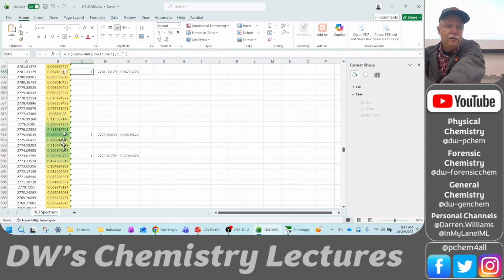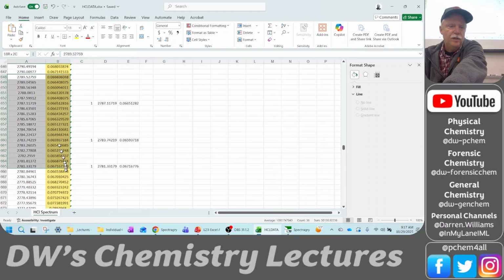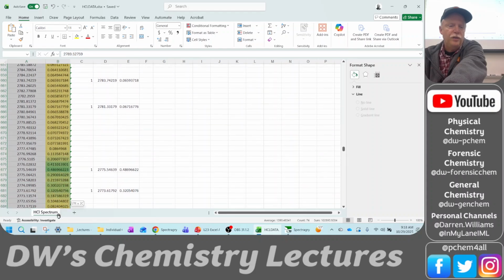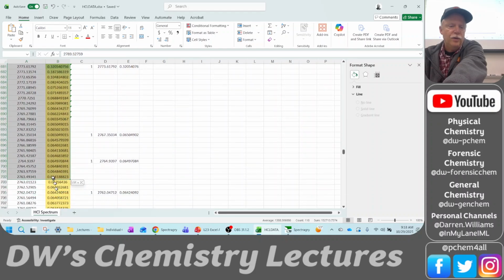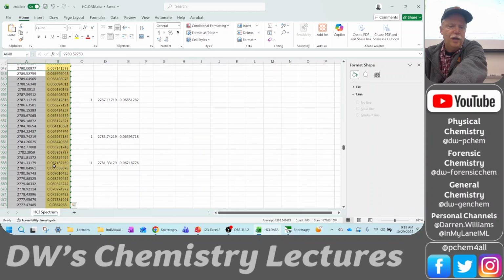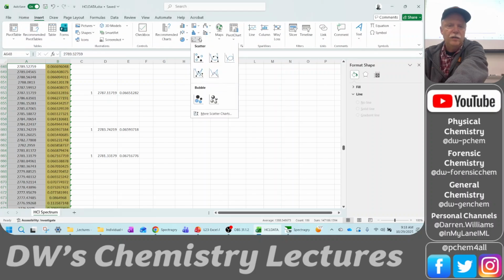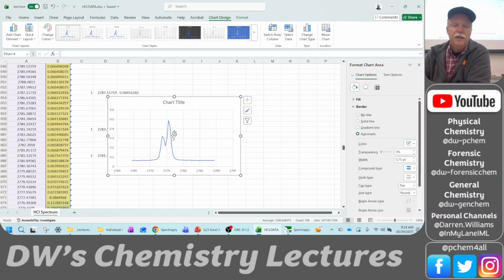So if it doesn't have the two lines right here, those two green lines, if you wanted to just check your work, let's look at this. I'll just have to prove to you, I guess, what is a good line and what is not. Okay, so look at the region I'm plotting. I'm plotting just that region. Insert, plot. See, I've got 2 peaks. All those other little lines in this plotted region are noise. So I'm just going to delete them.